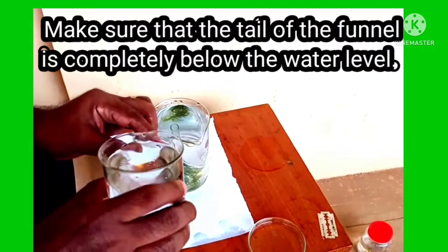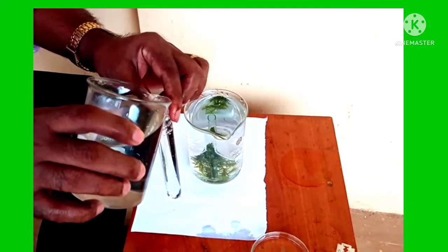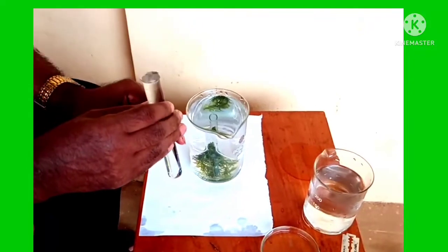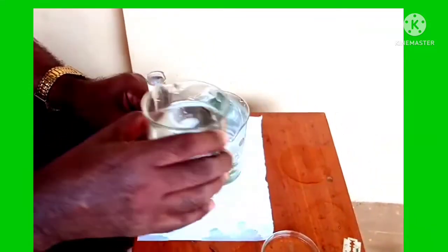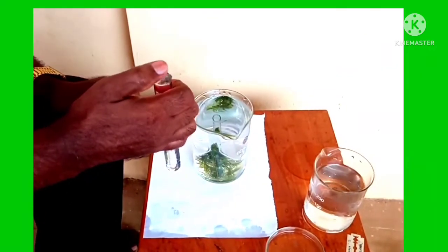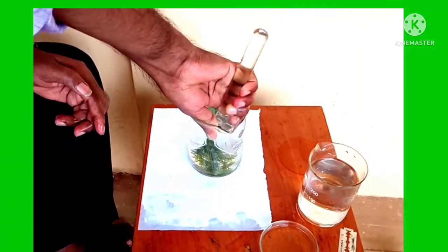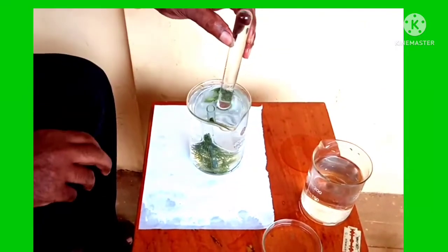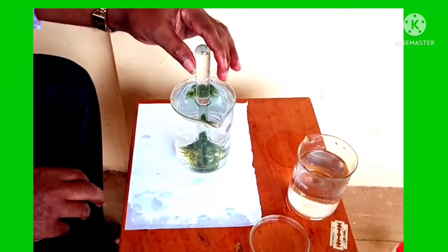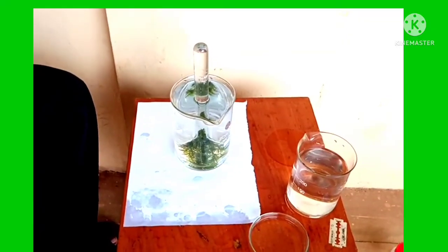Fill a test tube fully with water. Close the mouth of the test tube with your thumb so that water does not ooze out. Invert the test tube and place it in the water. The inverted test tube can be easily slid over the tail of the glass funnel without spilling water.